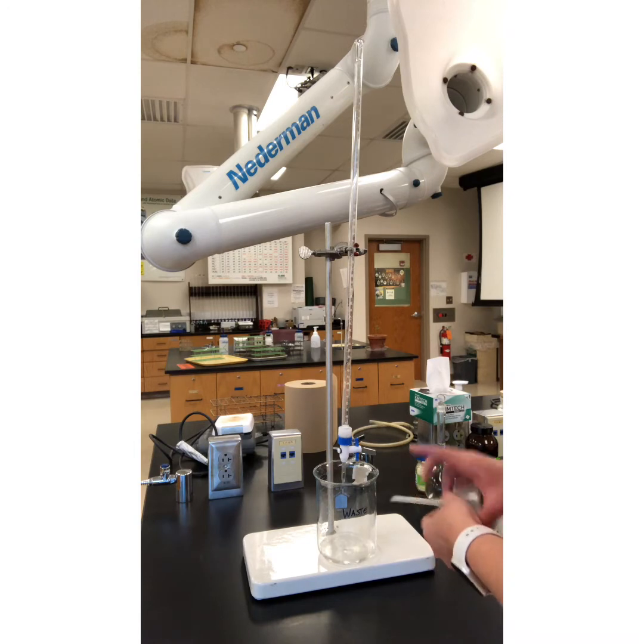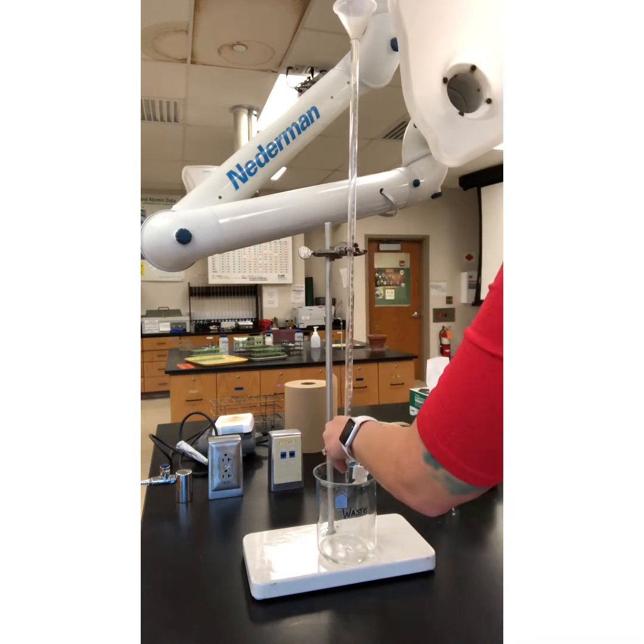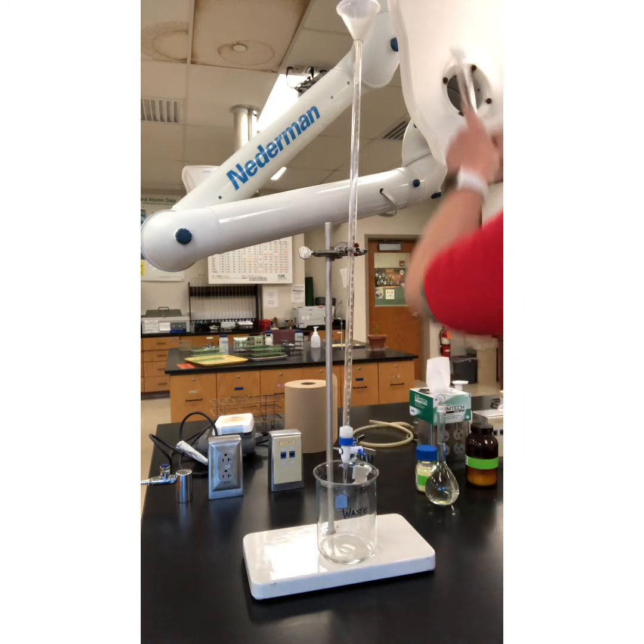Let that drip out. Do one more small rinse. My zinc sulfate.